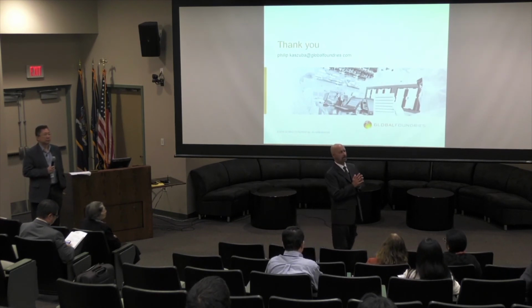My rationale is we've got a lot of experience with scanning capacitance right from the very beginning. Actually, Jim Slinkman was a colleague of mine, and we worked together developing SCM into a more usable technique, while Wilfred was in parallel developing scanning spreading resistance.